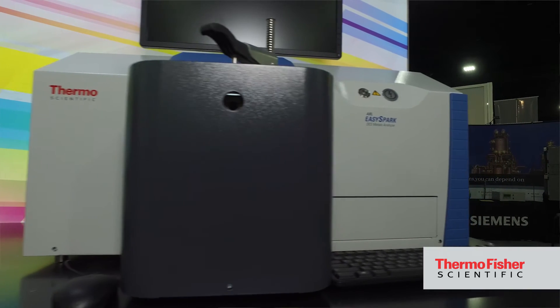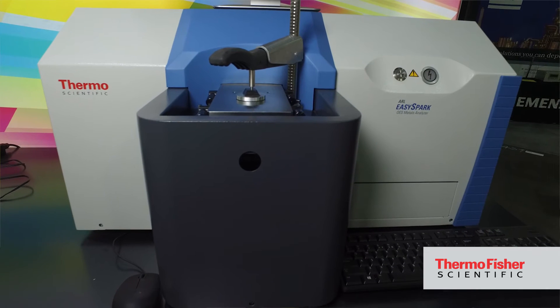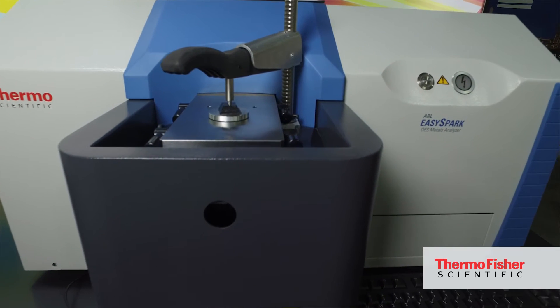The ARL EasySpark is an affordable spark optical emission spectrometer for many of the secondary metal producers, foundries, and casting companies who need reliability, reproducibility, and accuracy for further analysis.